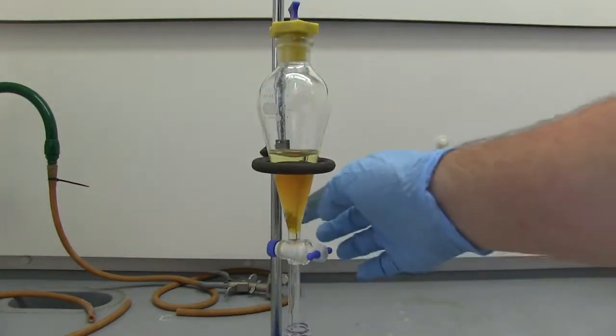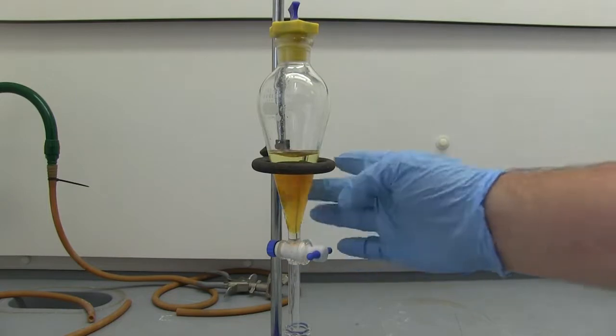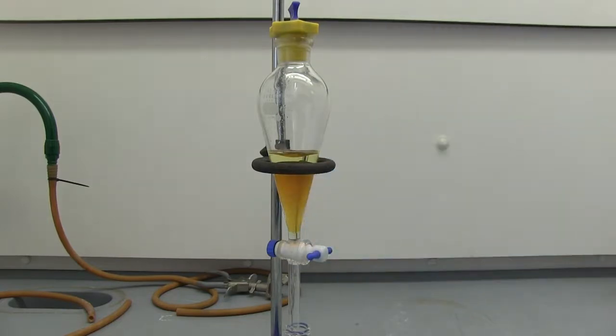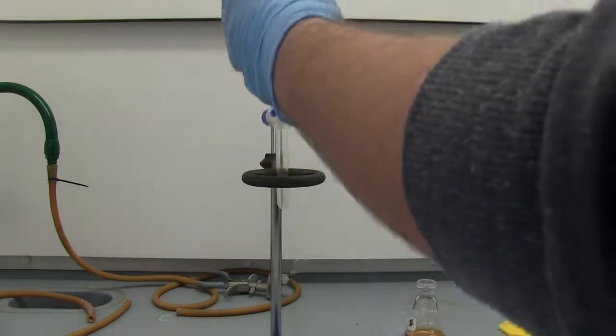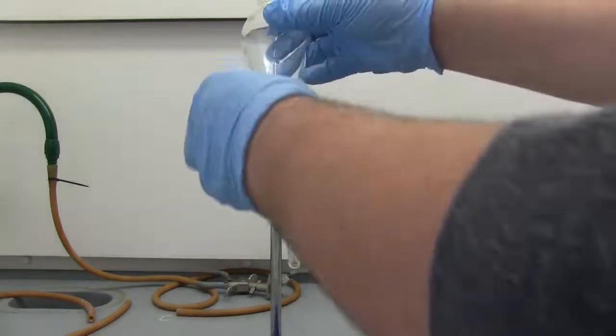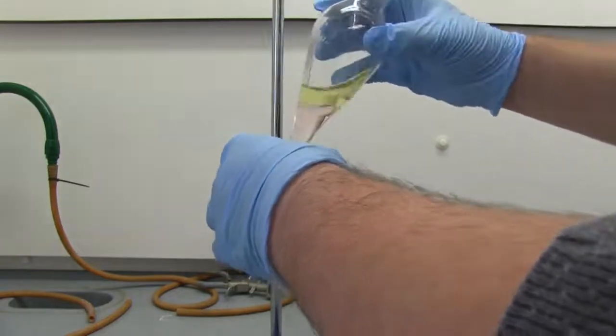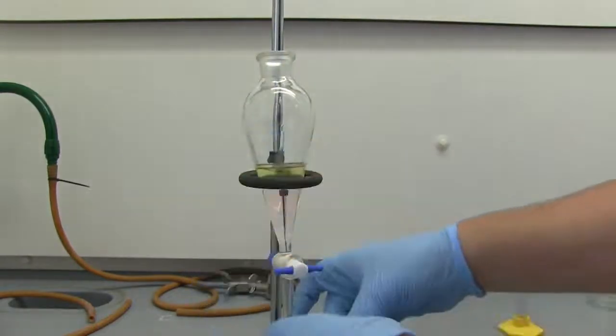All right, so first we're going to drain off this bottom layer, set it to the side, and we'll get our DCM layer, which is just the other layer. All right, so now we're going to add another 10 mL of dichloromethane and re-extract. All right, so our DCM layer is in the bottom and we're going to combine that with our previous DCM extract.